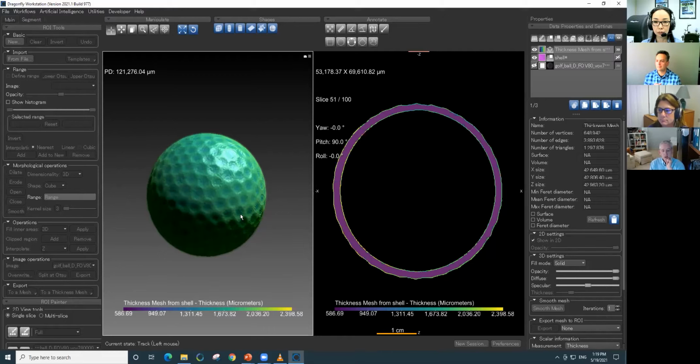So your best bet, if that's your goal of solid volume modeling with finite element, is to go ahead and export in a standard surface mesh format like STL or PLY. There are about 5 other formats that can export. And then you can take that through a workflow in some other tool that optimizes your solid mesh that you would then be able to bring into finite element modeling.